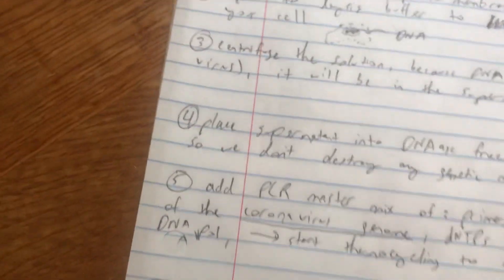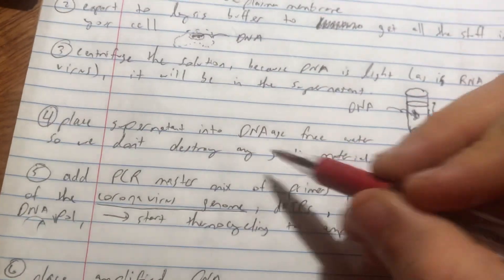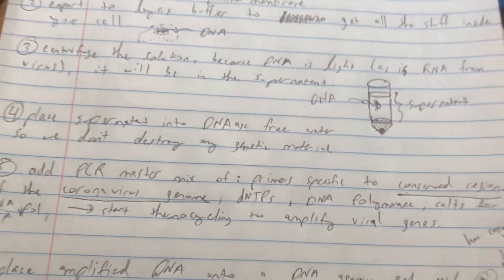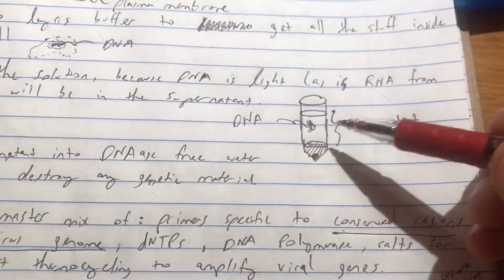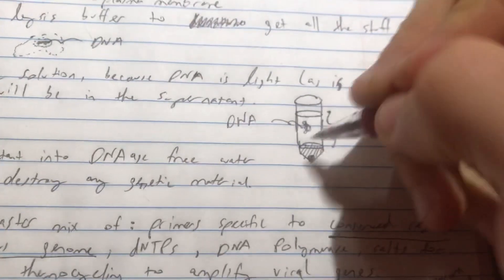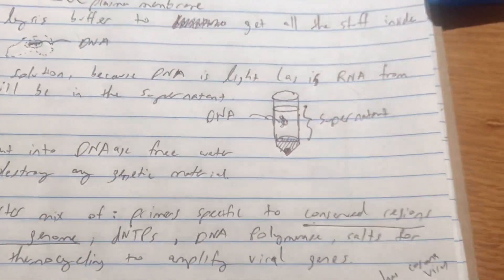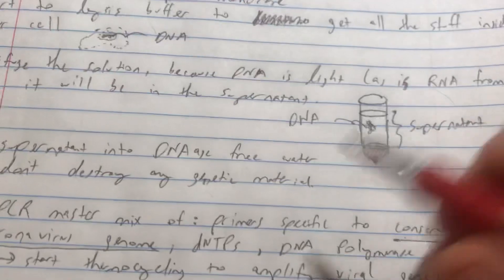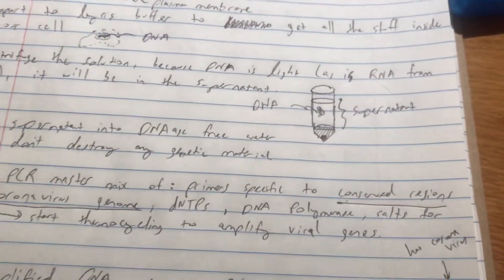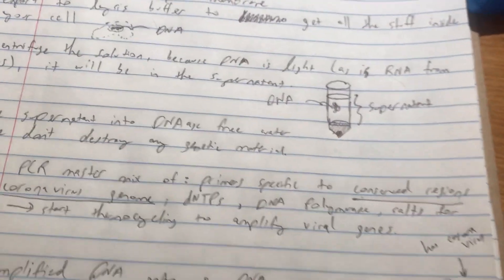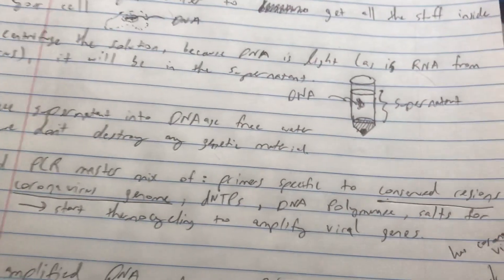What we do next is we're going to place this supernatant into DNase-free water. DNase-free water is important because basically if you have viral genes present in your supernatant, the last thing we want to do is actually denature any of these things. So having DNase-free water means that we're not going to run the risk of actually destroying any of the precious genetic material we're trying to test for.